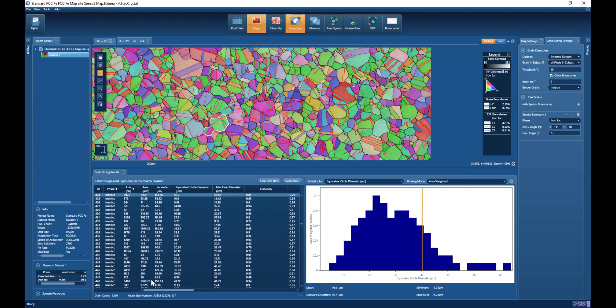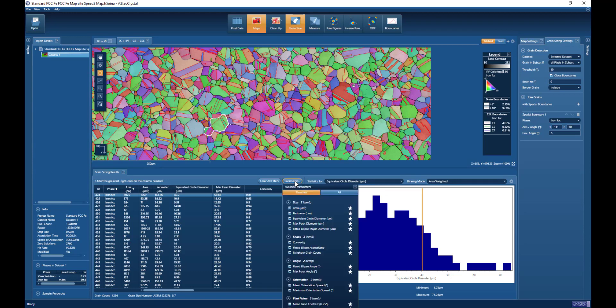Once again, we see the grain count, the grain size number down below the grain list, and the statistics relating to whichever parameter we've chosen. We have more parameters that we can measure in Aztec Crystal, and those parameters are selected by clicking on this parameter button here.